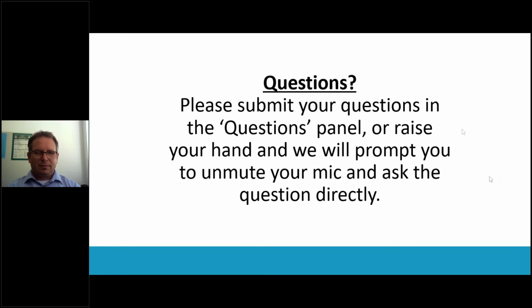Hello, thank you. It is someone from University of Erlangen in Germany. Thank you, Florian, for the nice presentation and giving a nice overview. You very nicely showed that there is a distinction between the water uptake at 30 degrees and 80 degrees, and I guess that is kind of obvious. But what is your take on that? What happens from the molecular point of view? Why is that so? Is it just because of the higher activity at 80 degrees, or is it really a structural change in, let's say, the Nafion membrane?